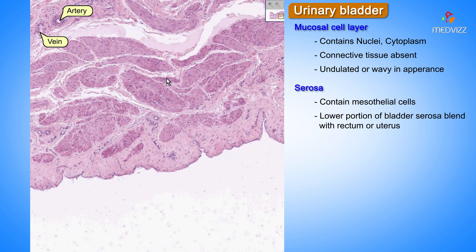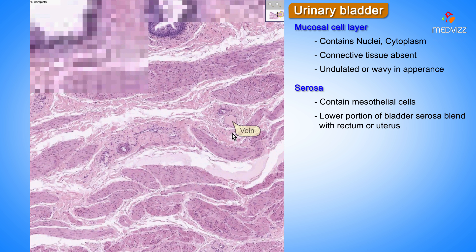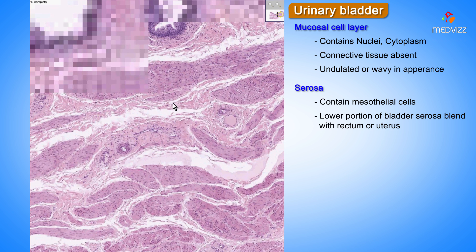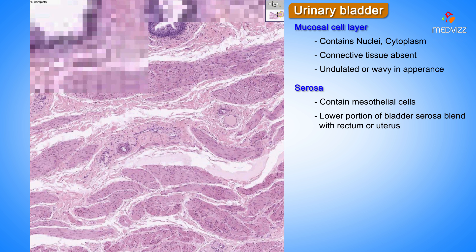The dome and much of the anterior and posterior surface is a true serosa. Here's an artery, there's a vein, here's smooth muscle bundles, here's connective tissue of the serosa or adventitia, there's a vein, here's an artery, here's some more connective tissue. Notice that you may very well have a hard time differentiating the spindly fibroblasts of the connective tissue from the spindly nuclei of the actual smooth muscle bundles of the detrusor muscle.